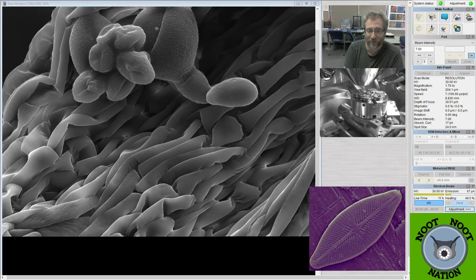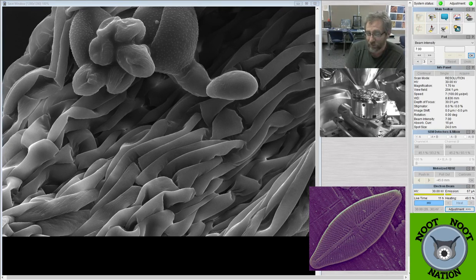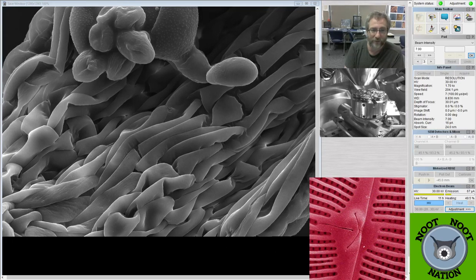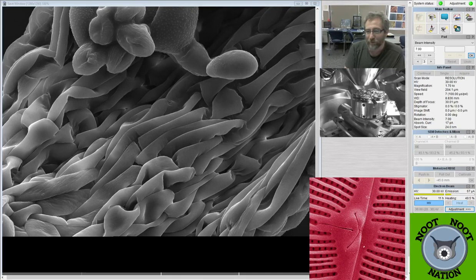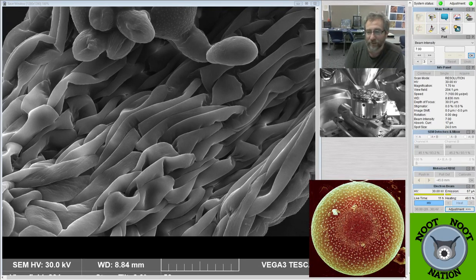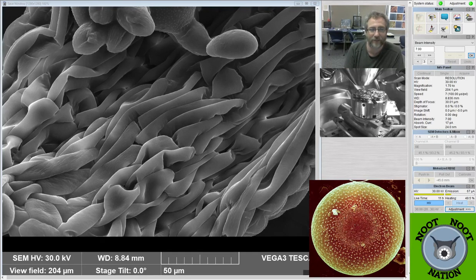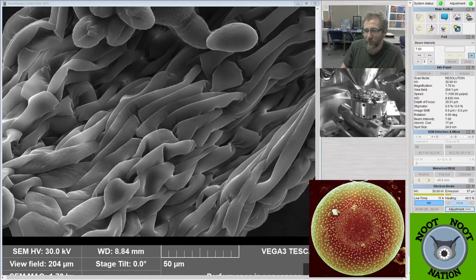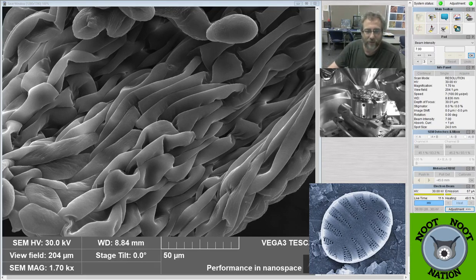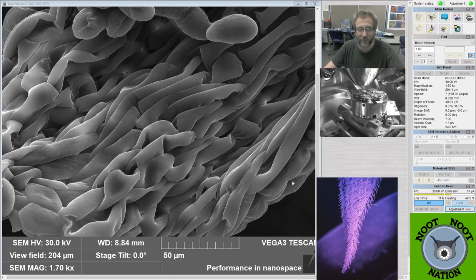I don't want to be a supervillain for anything. So, aside from plants or things that clone themselves, I tend not to kill them to put them in the SEM. Insects that we've looked at have all been dead insects. They were dead before we started, and most of the organisms we've looked at, I collected from something where they were already dead, because I don't want to kill something in order to put it in there. Flowers are just a piece of a plant, so I didn't kill anything to do that, but I did sacrifice part of the plant. I think they'll be fine. They're mostly cultured, or they're living in my lawn, and there's a gazillion spring beauties like these ones. They'll be fine if I take one or two.